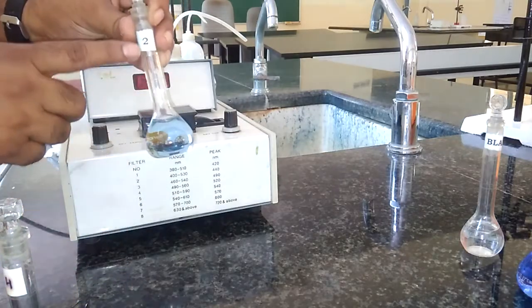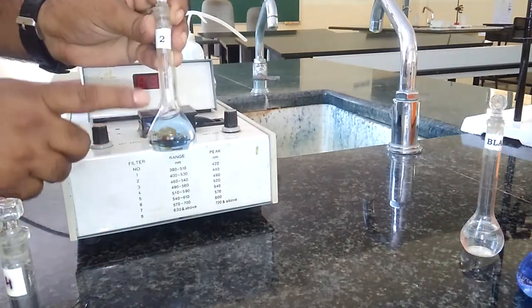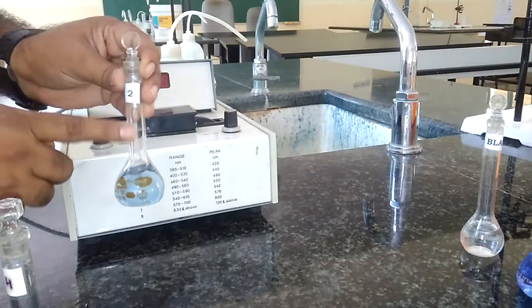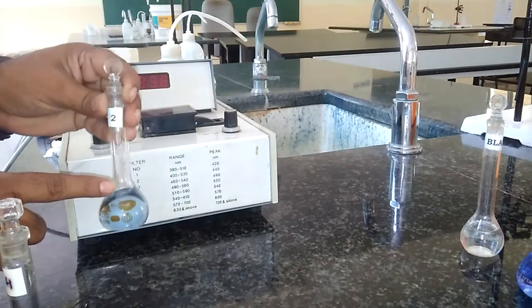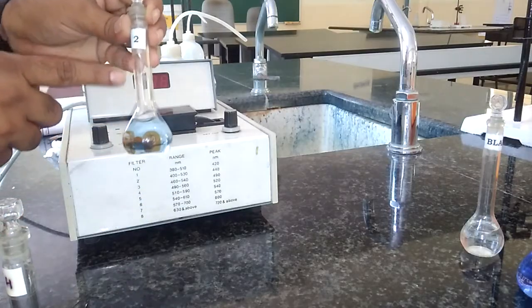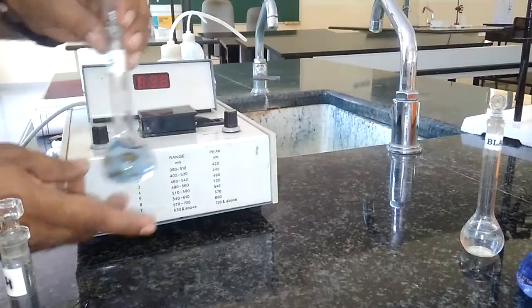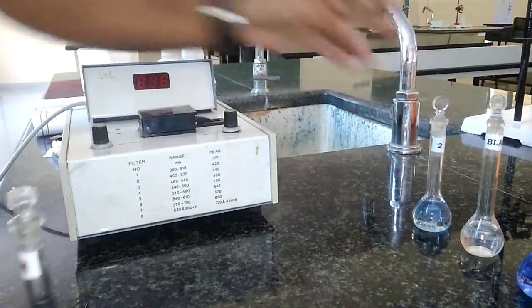This copper sulfate solution is prepared by adding 2 ml of copper sulfate and then 2.5 ml of ammonia, which acts as a coloring agent or complexing agent. Then the rest is distilled water — that is, after the 25 ml mark, we add distilled water. This is how we prepare this first standard.